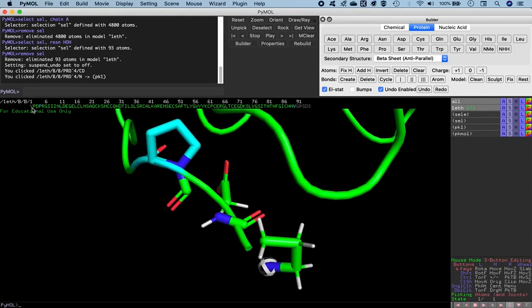And then the next one that you have is valine, because the nitrogen for the proline is already selected out here. So this is a fascinating thing with the builder tool, that it automatically recognizes in which terminal you want to build on the residues, the missing residues basically, and it keeps on selecting the respective atoms, whether it be the nitrogen for the N terminal, or the carbon for the C terminal.